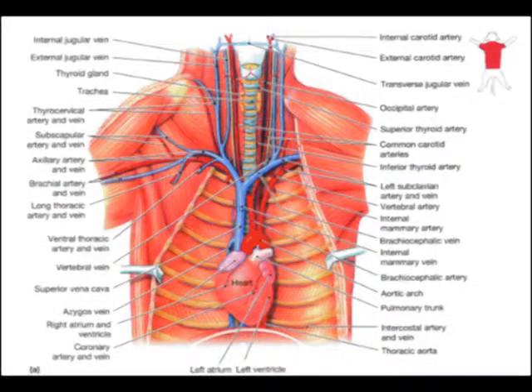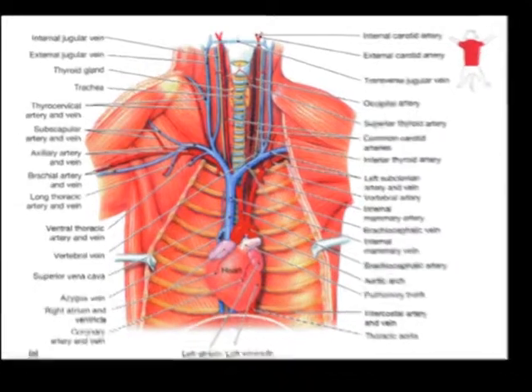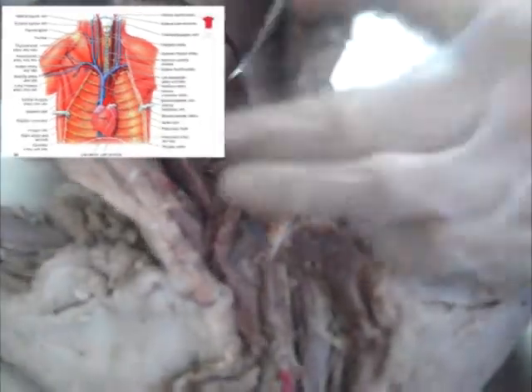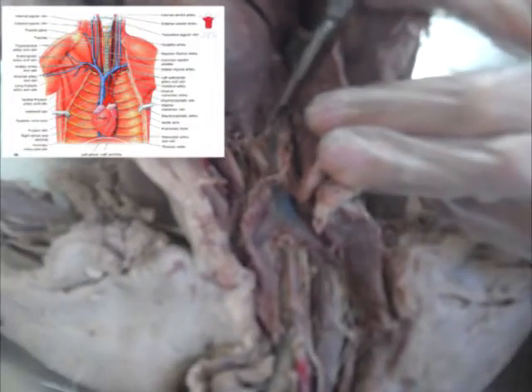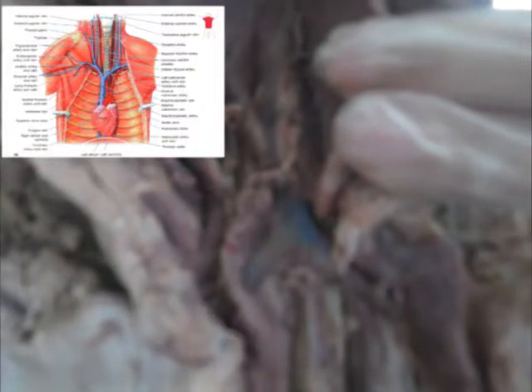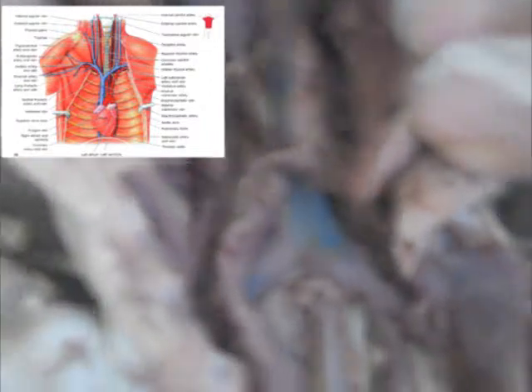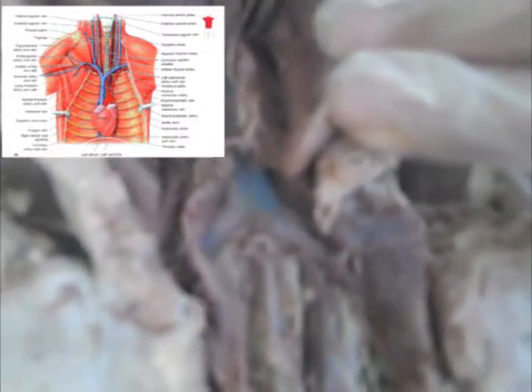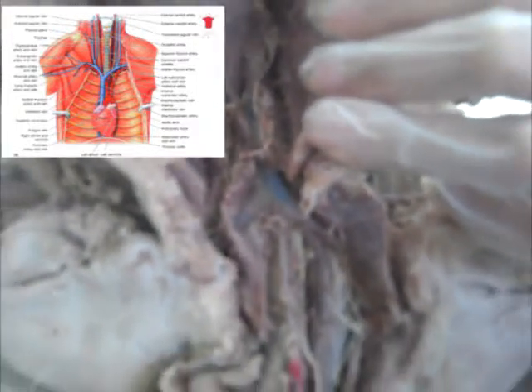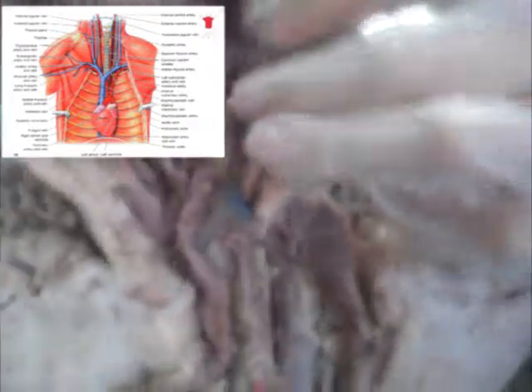Basically, the cardiovascular system delivers oxygen around the body through the use of blood. And these tubes right here, the reddish brown one is called an artery. It holds oxygenated blood and delivers it throughout the body. This right here is the vein, which has deoxygenated blood, and it's blood returning from those body parts back to the heart so it can be oxygenated.